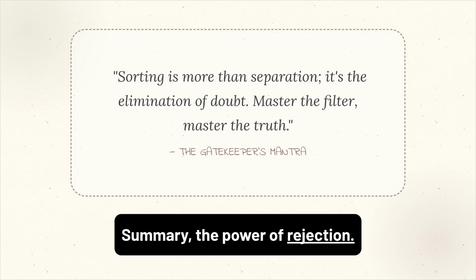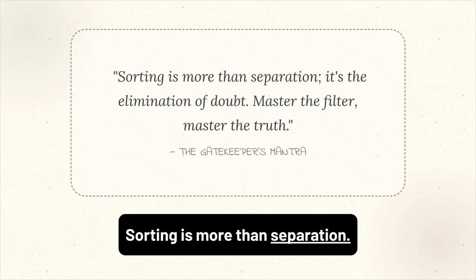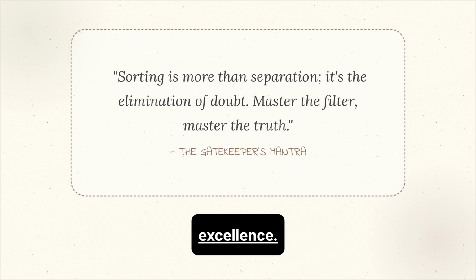Summary: the power of rejection. We've mastered the 4 rods, the RF/DC balance, and the logic of stability zones. Sorting is more than separation. It's the elimination of doubt. Master the filter. Master the truth. You are now equipped to run the industry's most powerful targeted workflows with professional excellence.